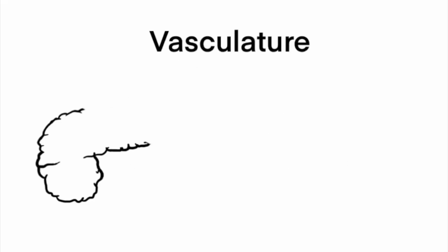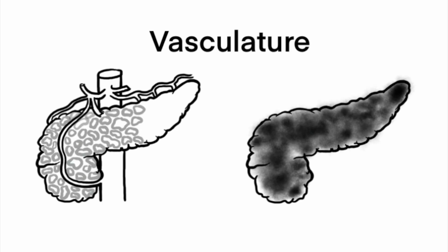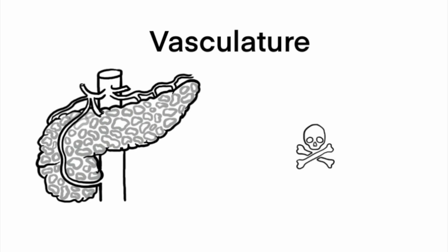Printed constructs require vasculature to prevent necrosis. Bioinks can be used to print organs with pre-formed vasculature to be perfused immediately to prevent cell death in the printed tissue.